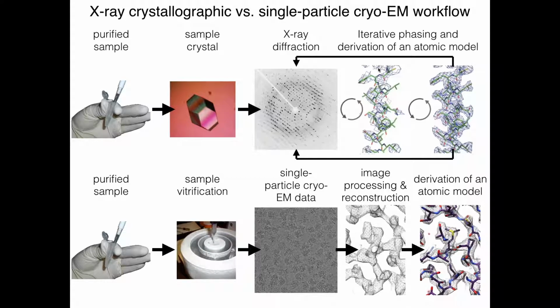There are analogies with EM, albeit with a few key exceptions. So you also need a purified sample. Arguably, it doesn't have to be as pure.